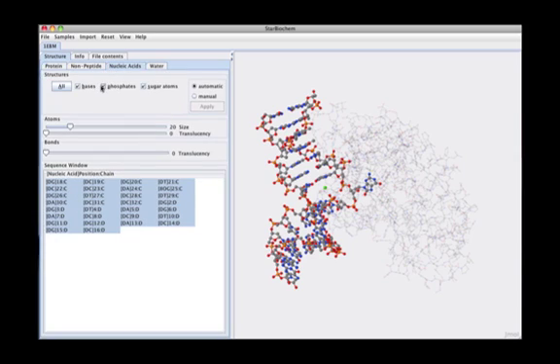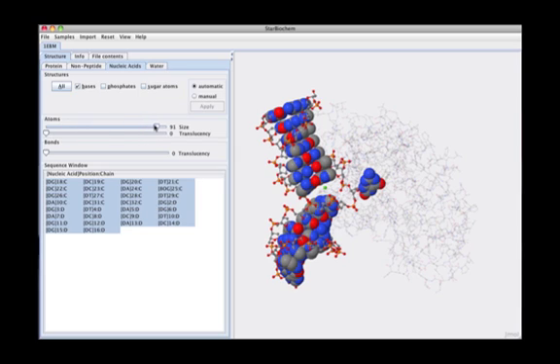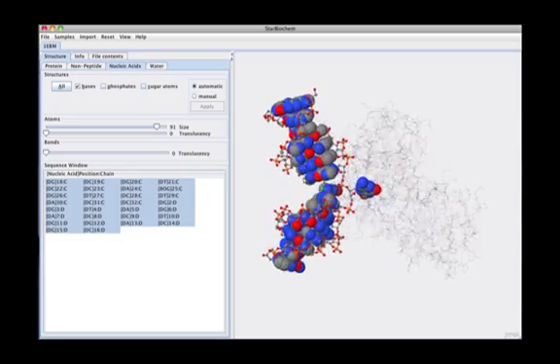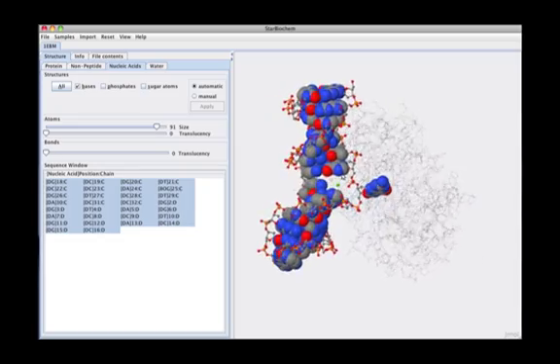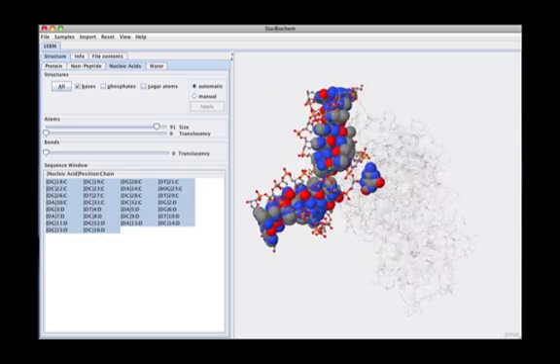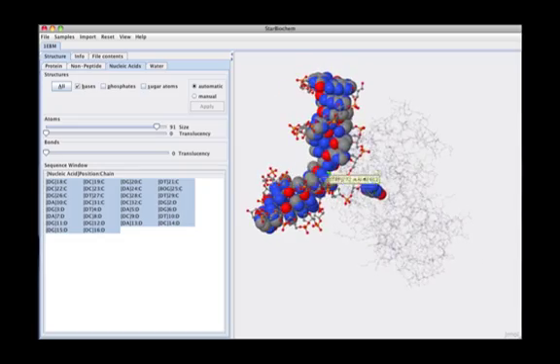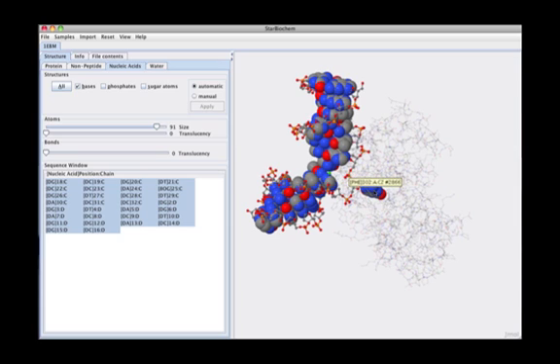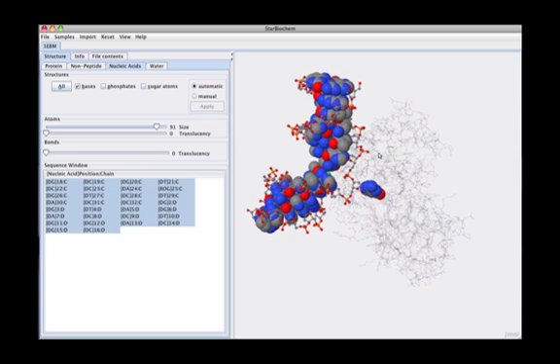For example, highlighting the DNA bases and obscuring the protein provides a snapshot of how the structure of this protein relates to its function. The DNA glycosylase protein flips out a DNA base in the double helix to check for mutations as it travels along the DNA.